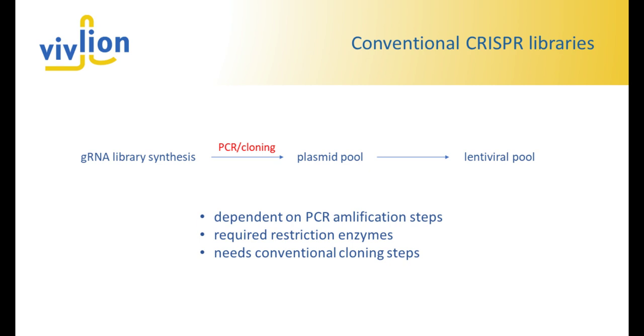And that's not surprising, because when we want to make a highly diverse reagent, like for example a genome-wide library, then the material that we get off the synthesizer is fairly limited. What that results in is that we have to PCR amplify our product. This is a natural step, and what that means is that we introduce a PCR bias into the distribution of our sequences.